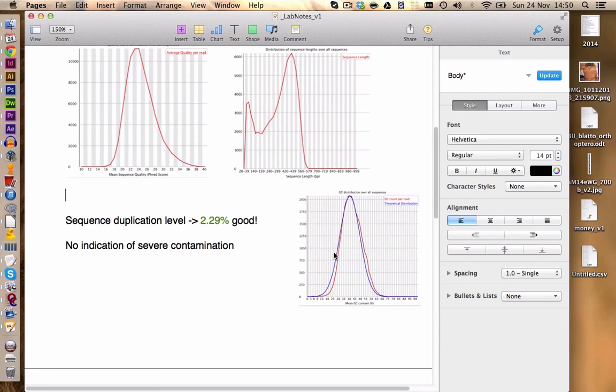Well, the data itself looks all right. We have some problems with the sequence quality, but we have applied clipping, and now we just need to deal with some more sequences which do not have the best length overall. And maybe we also find that some sequences have higher mismatches, so higher reading errors from the 454 sequencing. But other than that, the dataset should be fine to assemble our mitochondrial genome. So the next step is to load our sequences into Geneious.